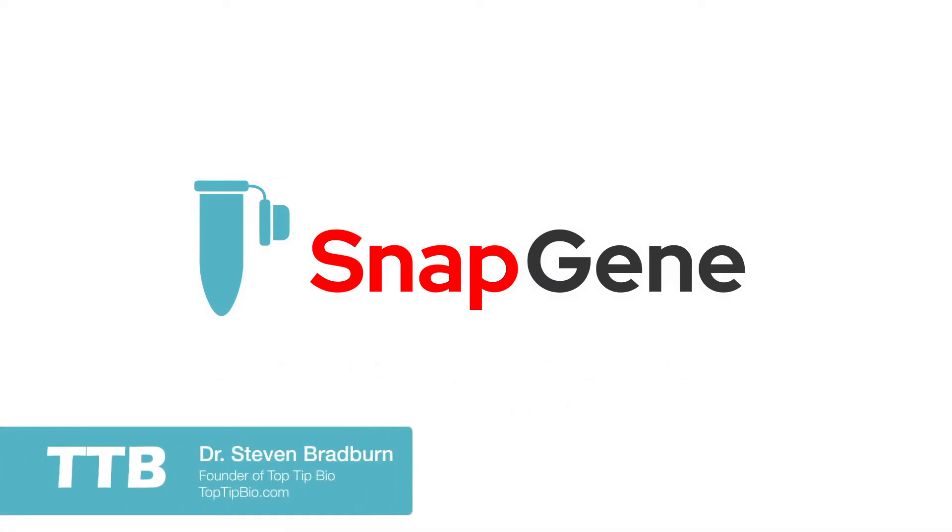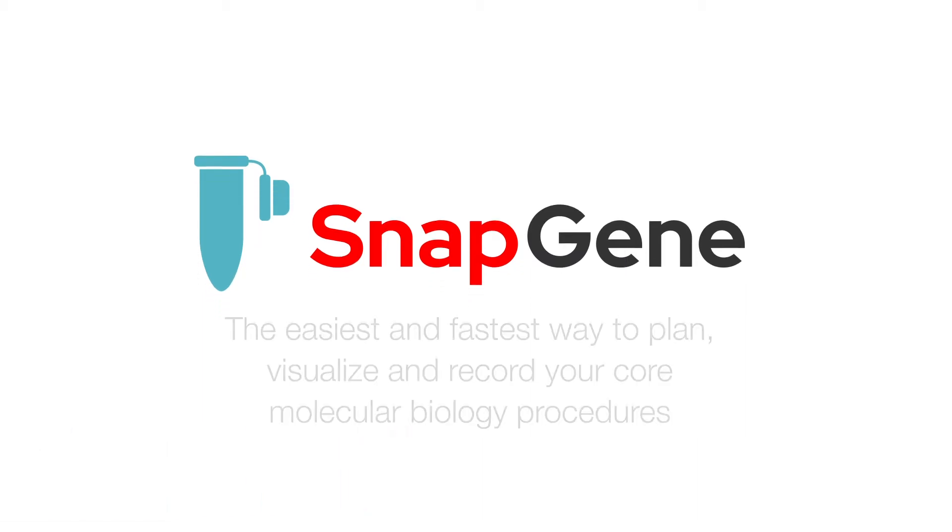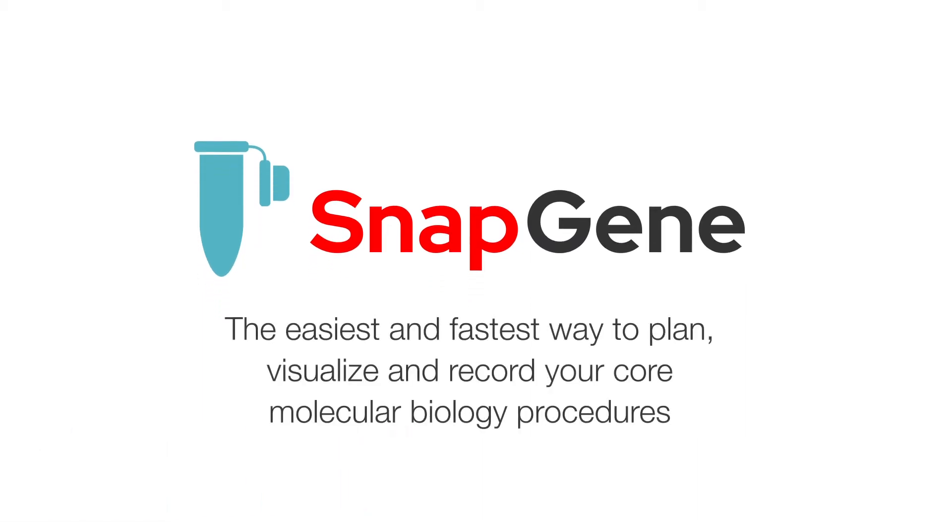In this video, we will introduce you to key features that help you simulate molecular biology procedures in Snapgene. Snapgene is the easiest and fastest way to plan, visualise and record your core molecular biology procedures.